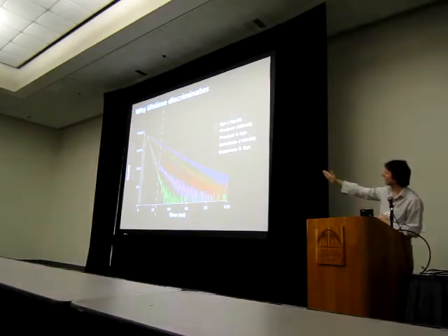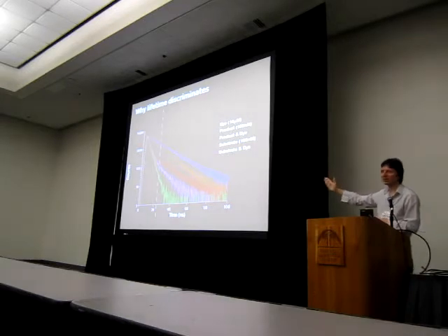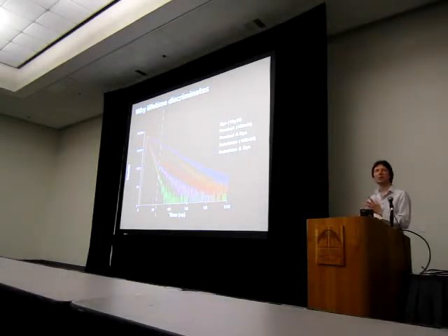So you can see there, to the right of that dashed line, the slopes of the lines are identical. So this is just a simple explanation of how fluorescence lifetime achieves discrimination against fluorescent impurities, compound fluorescence in real life.